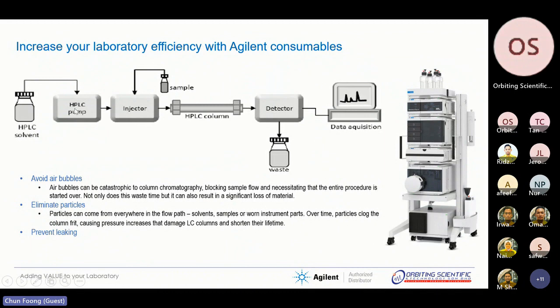Then all these are particles, because remember that the solvents, the mobile phase, will pass through the column. So they will tend to accumulate at the column side and cause high back pressure and damage the LC column.